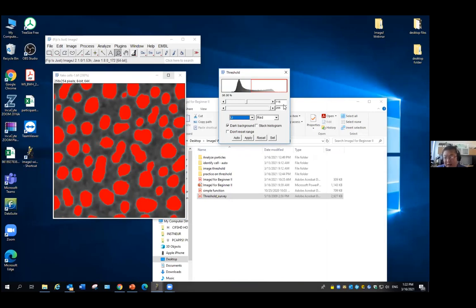So what they did is they read all your pixel intensities and make the decision for you. You can still freely choose what you want, but you can also ask the program to do it for you. So why does the program have an advantage? Actually, next week, when we have a special topic to concentrate on thresholding and segmentation, we'll talk about how the thresholding method can overcome some background change.